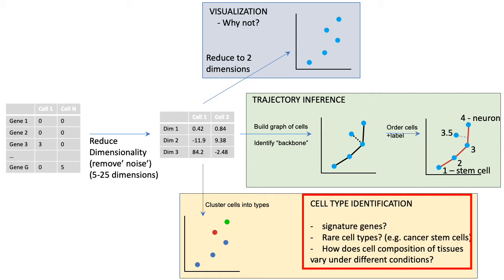Some of the other important tasks include, sometimes it's important to characterize, for a given sample, what proportion of that sample is composed of cells of one type versus another. This can be useful, for example, when you're studying immune cells sequenced from patients that are undergoing an infection versus not. By looking at the changes in the types of immune cells present in the blood, you can get some idea as to what type of immune reaction a given individual has.